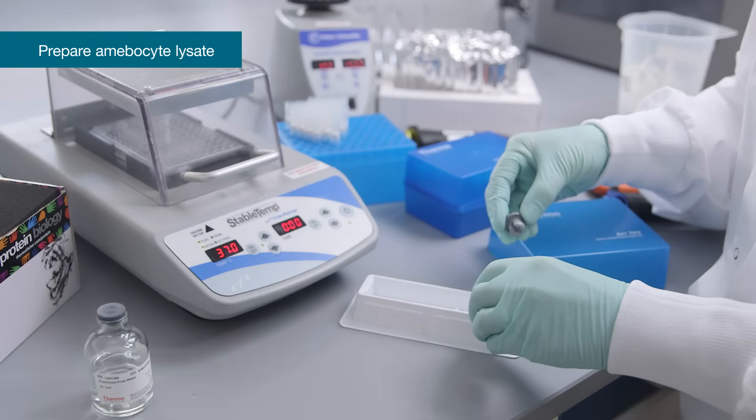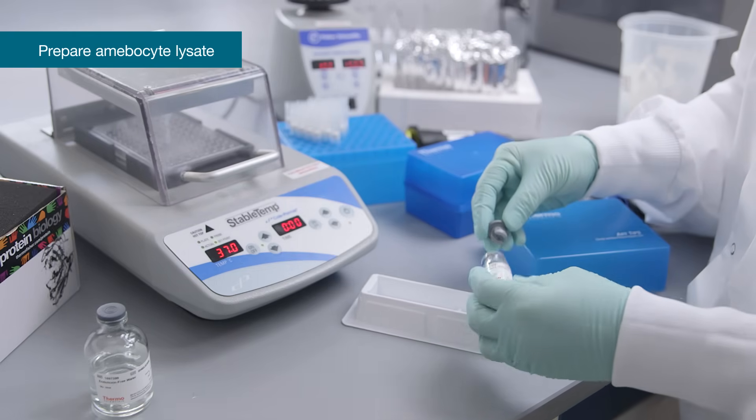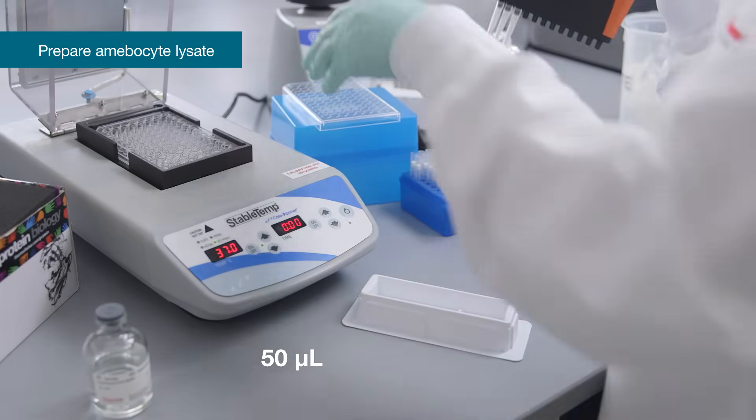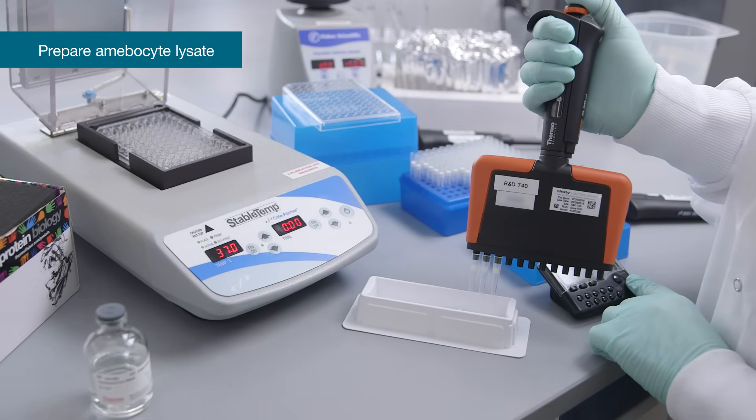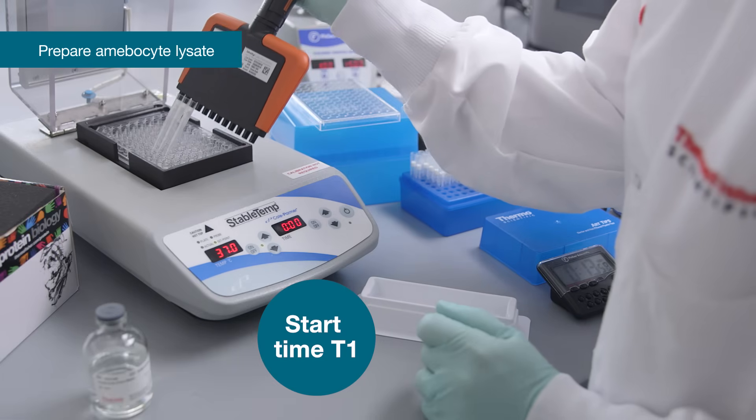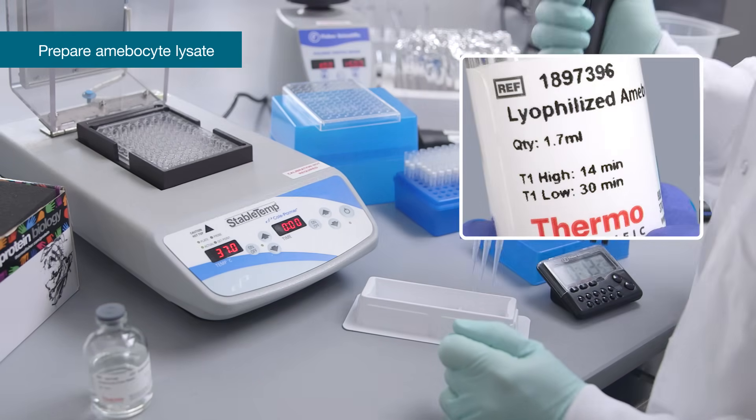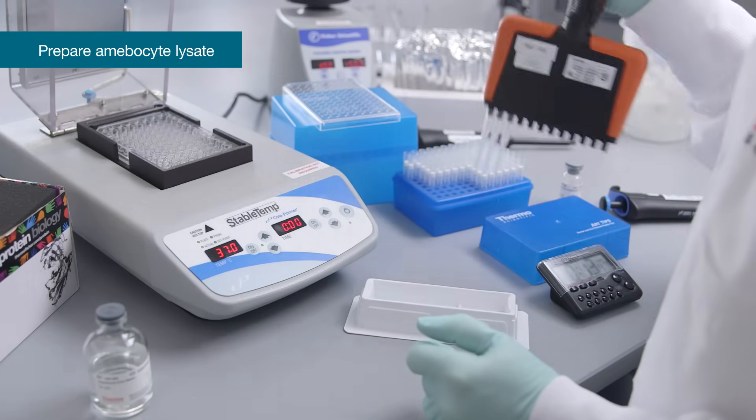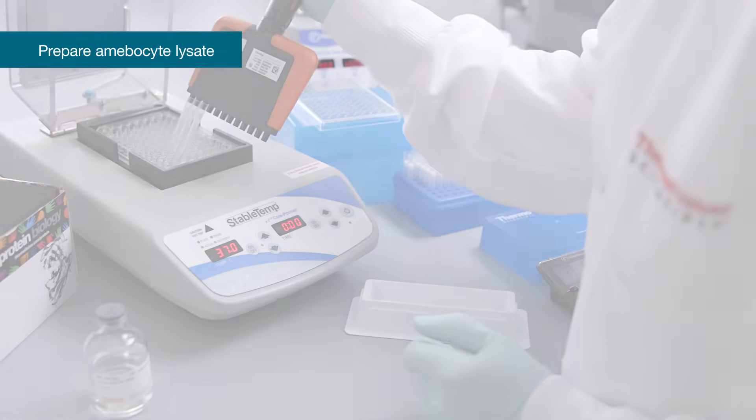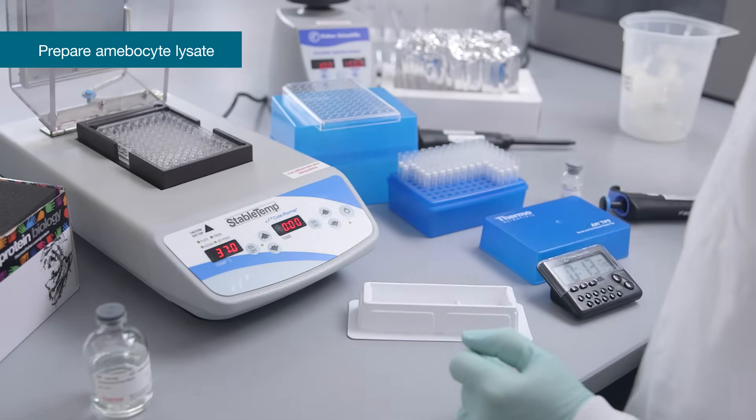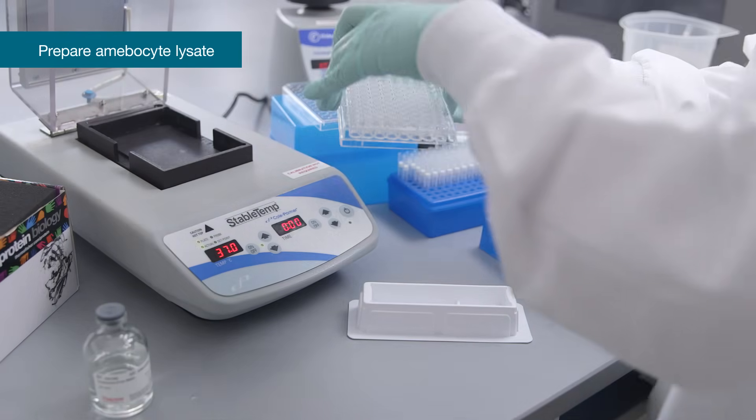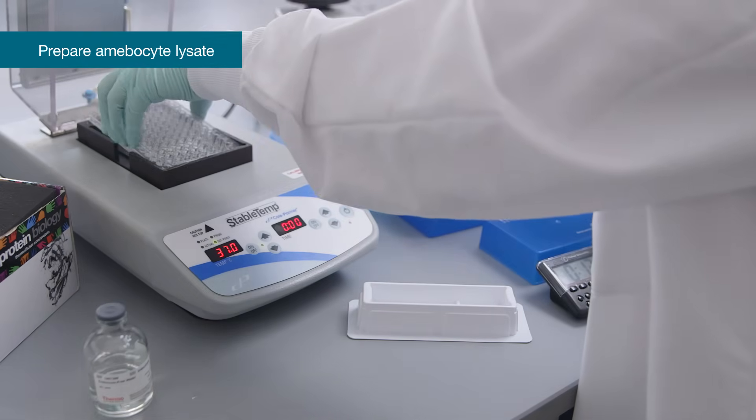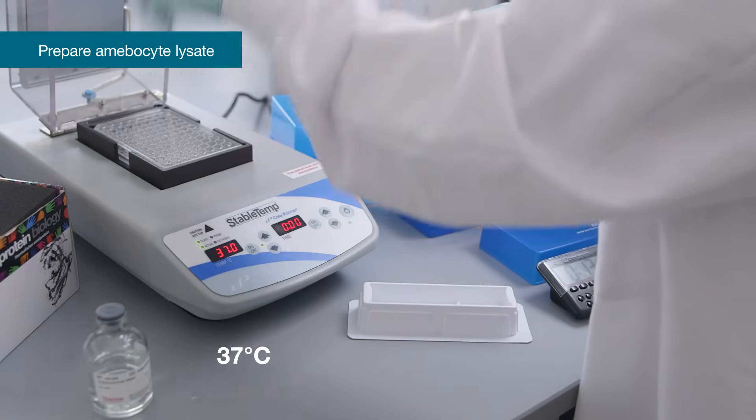Pour reconstituted lyophilized amebocyte lysate into the pyrogen-free reservoir. Using a multi-channel pipette, add 50 microliters per well of the reconstituted amebocyte lysate reagent. Start time T1 as the amebocyte lysate is added to the first wells. Note that the time T1 incubation varies between the high and the low standard ranges, as indicated on the vial. Once the amebocyte lysate reagent has been added to the plate wells, briefly remove the plate and mix by gently tapping 10 times on the side of the plate, avoiding spilling. Return the plate to the plate heater and resume the incubation at 37 degrees Celsius for the remaining time T1.